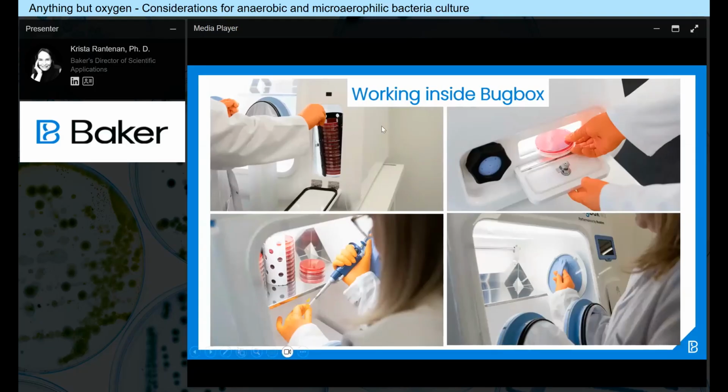Yes, and on the right-hand side up, there is a picture of a single plate entry system, inserting an individual sample plate or some other small materials quickly and gas economically into the chamber. And on the lower side, you can see that the hands are in the workstation.